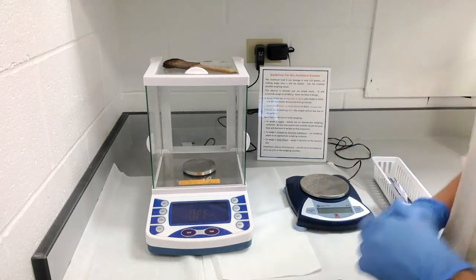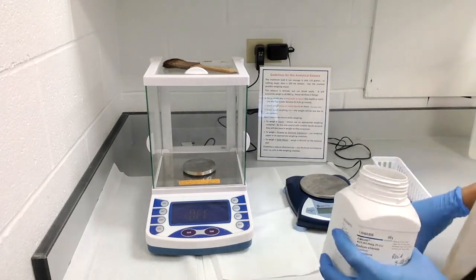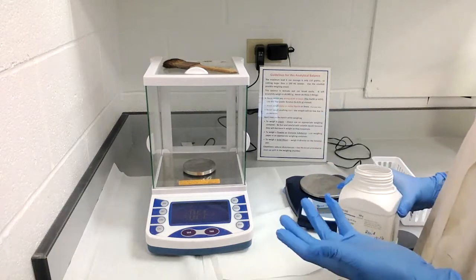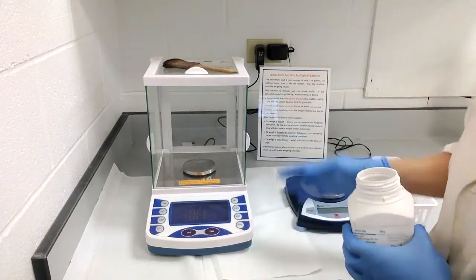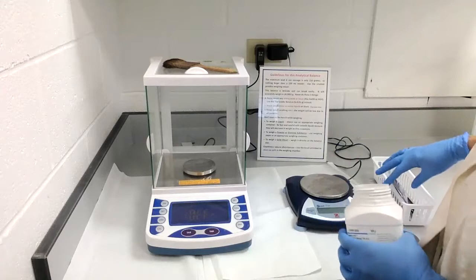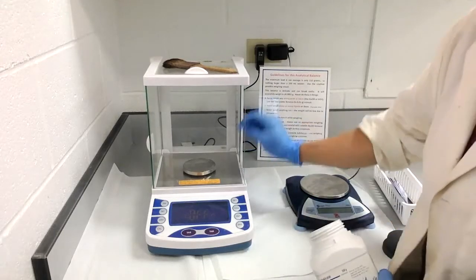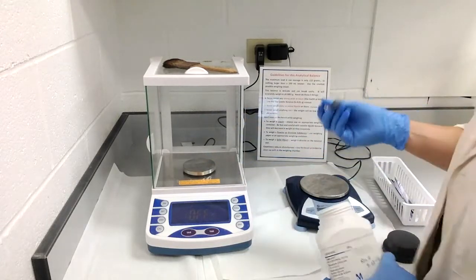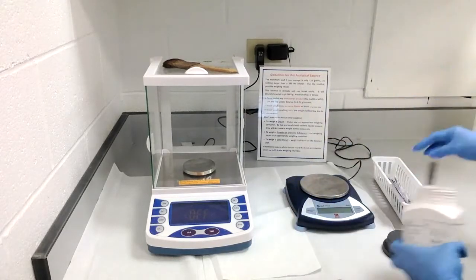When walking up to use either balance — I'll be weighing out some sodium chloride, just some salt — it's a good idea to wear gloves, because you don't know what type of chemicals have been on these devices. You also never want to weigh directly onto the silver stages. You wouldn't take a spatula and just start weighing directly onto that. Absolutely not — you're going to weigh into something.